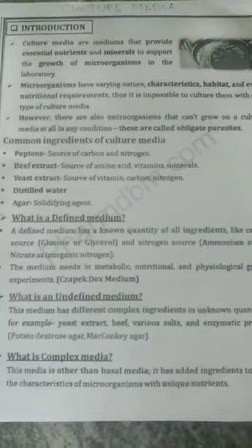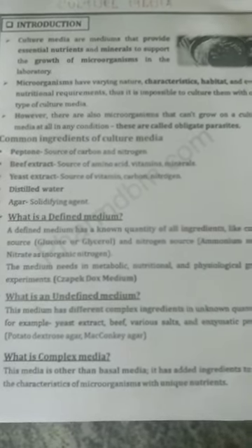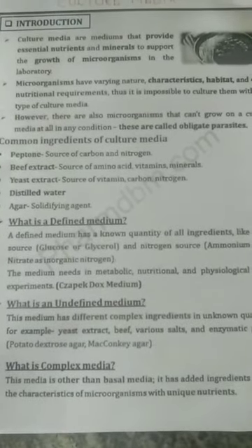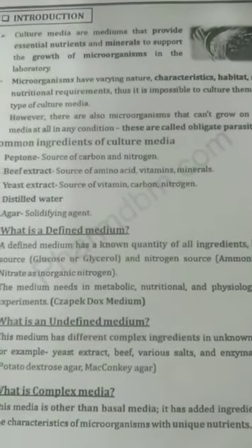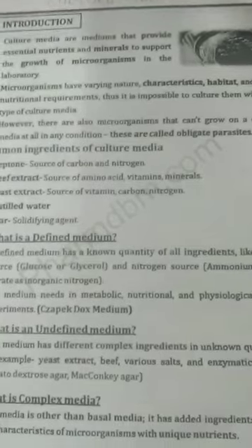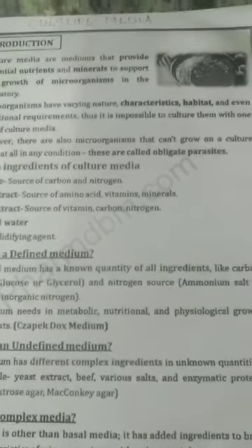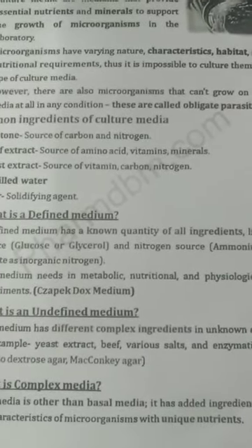Today we have to discuss about the culture media. Culture media are mediums that provide essential nutrients and minerals to support the growth of microorganisms in the laboratory. Microorganisms have varying nature, characteristics, habitat, even nutritional requirements.